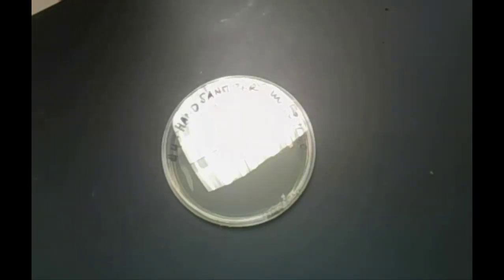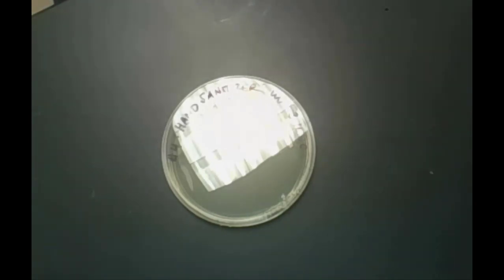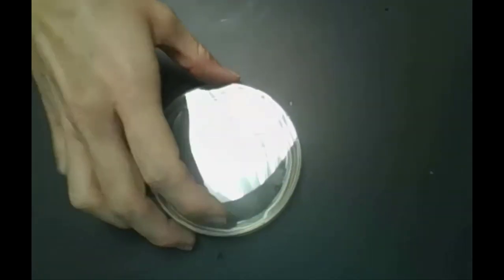Next up — I'm going to dirty my hand so I can do the hand sanitizer test. A lot of us carry around alcohol-based hand sanitizer. We're going to find out how effective that is. I just got my hands dirty, and I'm going to rub my hands together with the alcohol-based hand sanitizer. Now I'm going to take my hand sanitizer plate, open the lid, and make a print from those same fingers cleaned with hand sanitizer. That plate is done.